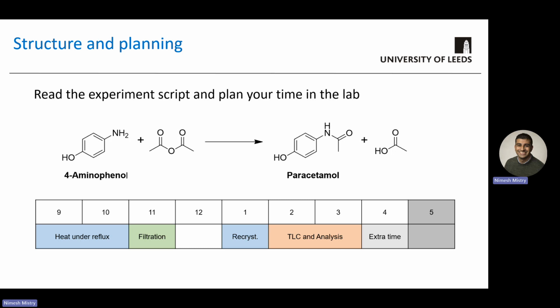So what will happen is paracetamol will crash out as a precipitate when you cool your reaction mixture down. Then you'll filter the mixture to isolate crude paracetamol. This is usually a good time to take a break, so it times in nicely with your lunch break.